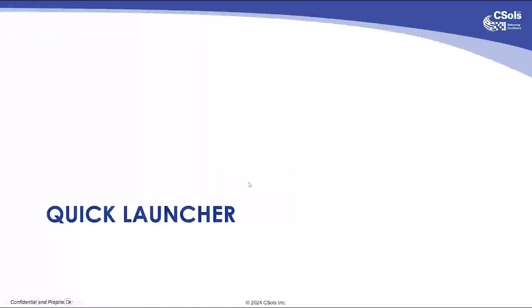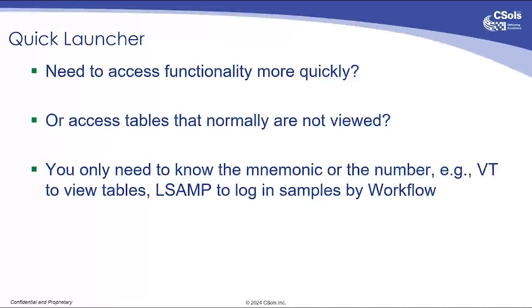So we'll start off with the quick launcher. Quick launcher has been around for a few versions now, but why would you need it? Well, perhaps you're tired of moving through menus, doing right mouse clicks on Explorer folders, and you want to leap straight into the functionality you want to run.